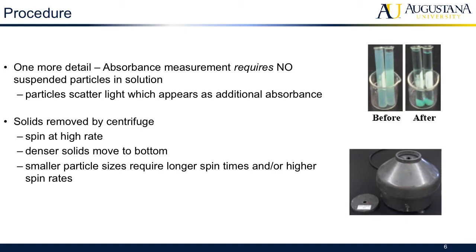Now, once you create the precipitate, you can easily measure the pH using your Vernier unit. But the solution, once you pipette it out into test tubes, it might look like this. It's a bit cloudy. And that's a problem because absorption spectroscopy requires a clear solution. And here you have a cloudy solution because there's a precipitate.